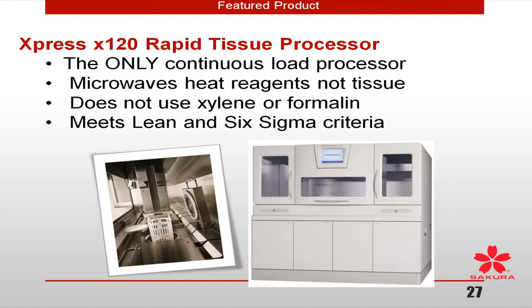Doesn't mean that you're going to cut it, stain it, and do it all the same day, but if you can take any portion of your samples in the same day that you receive them and move them to paraffin, think how that will affect your workflow. By setting up a continuous flow, a new workflow, you're able to address those specific and particular samples directly and more appropriately.